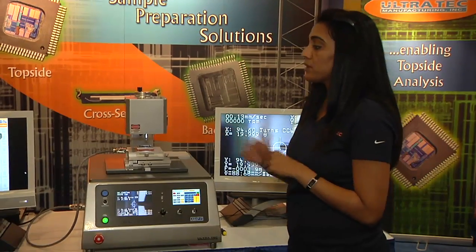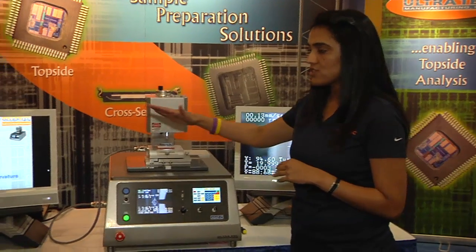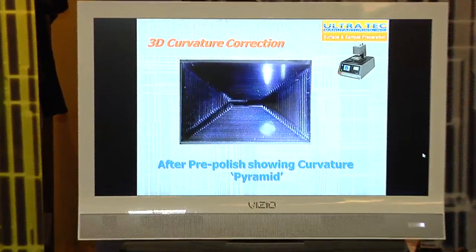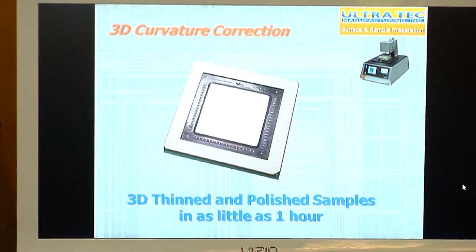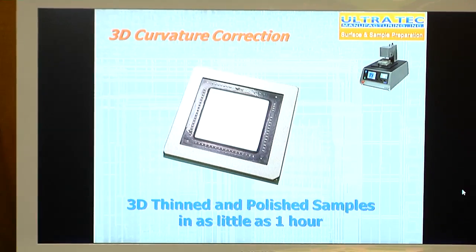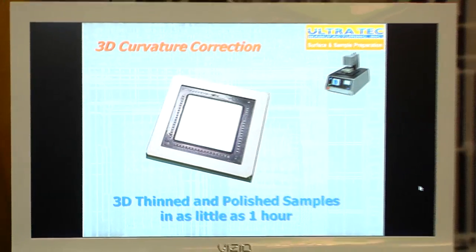Here you can see a pre-polished die — not a final polish. You can see the curvature pyramid on it in a spiral pattern, showing how the curve is followed in a pyramid method. Once you do a final polish, you get a 3D thinned, very close to planar flat sample, using both thermal and 3D curvature correction. Again, this can be achieved in as little as an hour per sample.